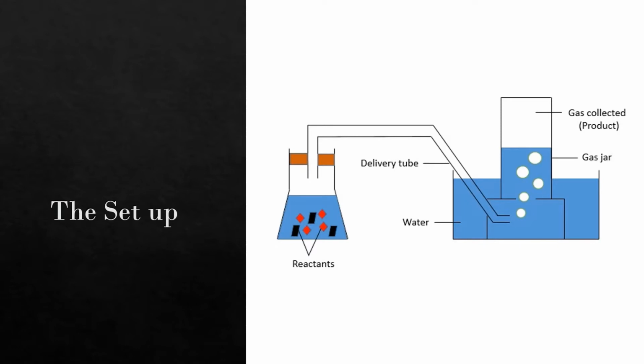Right here is your Erlenmeyer flask, and at that point right there, your rubber stopper. Even though it's quite angular, this thing right here is going to be our rubber hose, gas collection. It looks very wide, but this is going to be our beaker, and there's just going to be plain water in here. This water right here is non-reactive. It's just so that we can see how much gas we're getting.